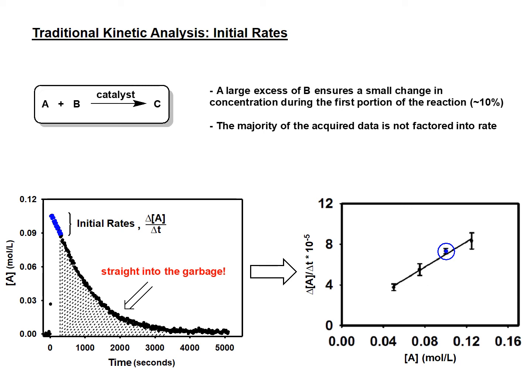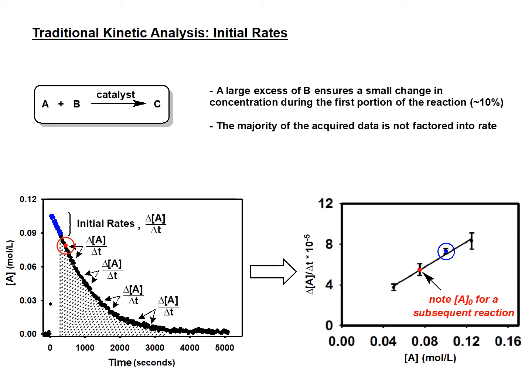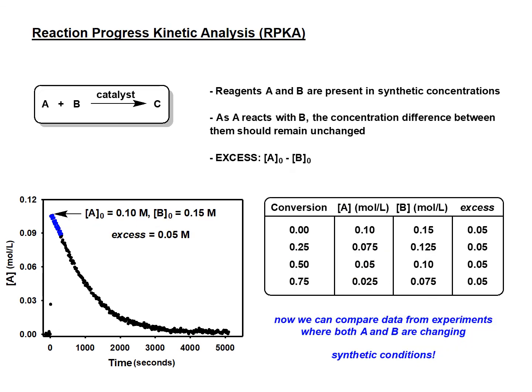All these graphs I'm showing you, this is all real data. I have this data somewhere. I didn't do a thing with it, nothing. But if you're clever, you can see that one of the concentrations you need to fill out one of the data points on your rate versus concentration plot is embedded within the one reaction you already ran. It's there already. If you thought about the entire reaction progression, you have rate data from time 0 to time final throughout the entire thing. Anytime you're changing concentration, you have rate data. And so reaction progress kinetic analysis takes advantage of this fact with one little trick.